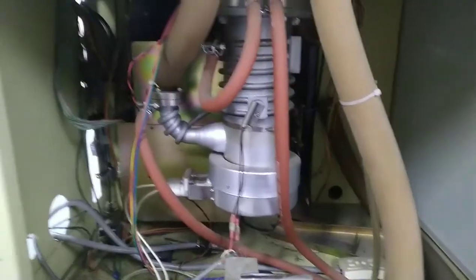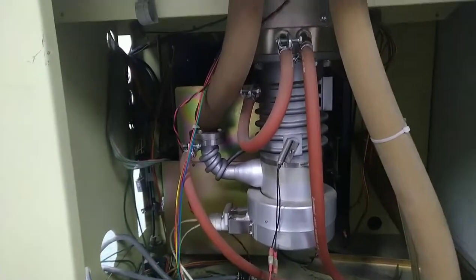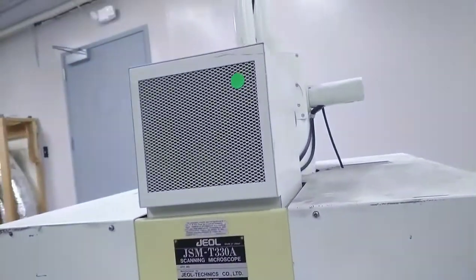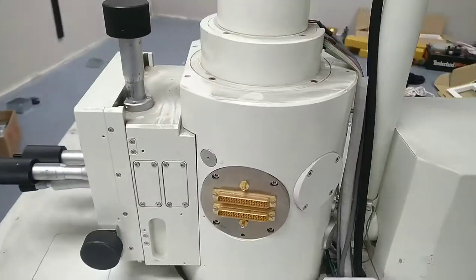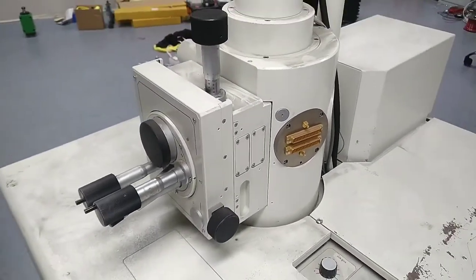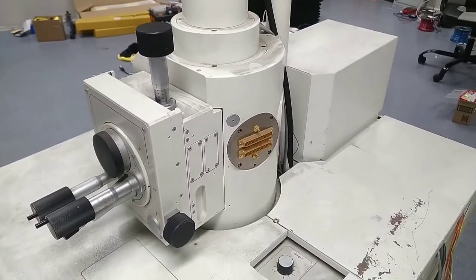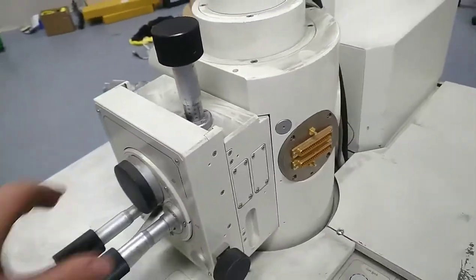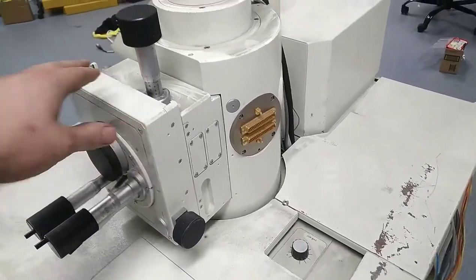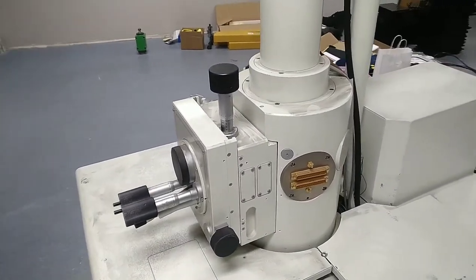You can see it has a diffusion pump. It didn't come with a roughing pump, but I got another one from the same place I got this. I know that there aren't any significant vacuum leaks, because up in here it's completely full of diffusion pump fluid — meaning something happened with their roughing pump at one point and it shot all the diffusion pump oil inside of it. I'd show you, but I don't actually know how to open this yet. The whole thing's isolated, but I had to shove it closed before I could pick it up.